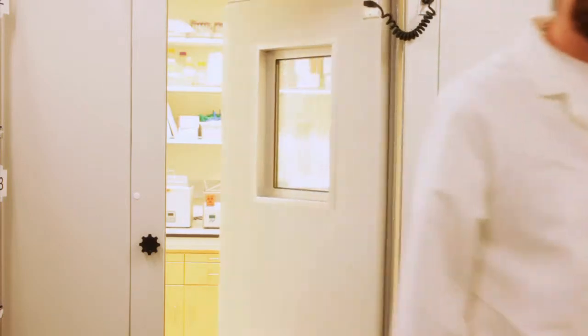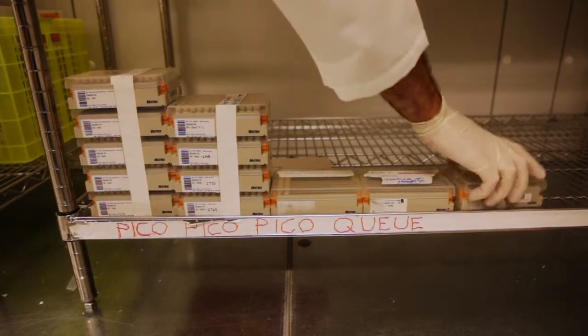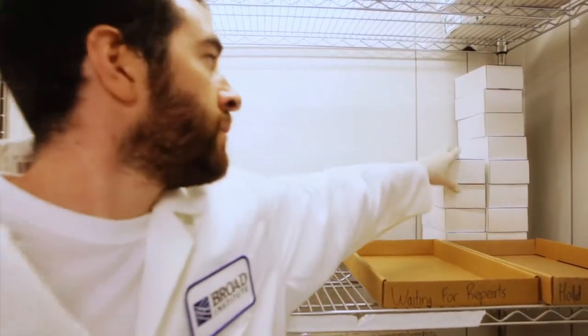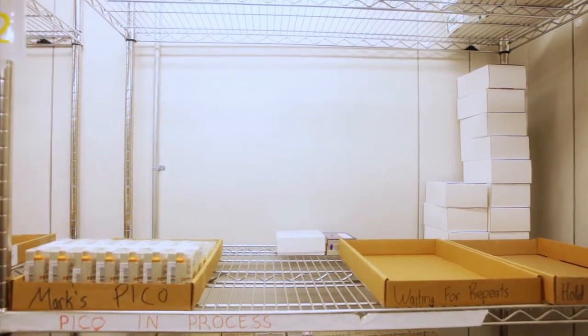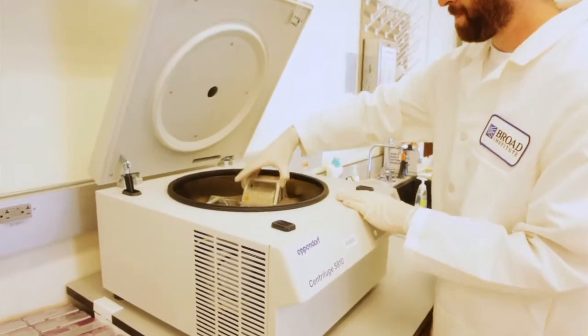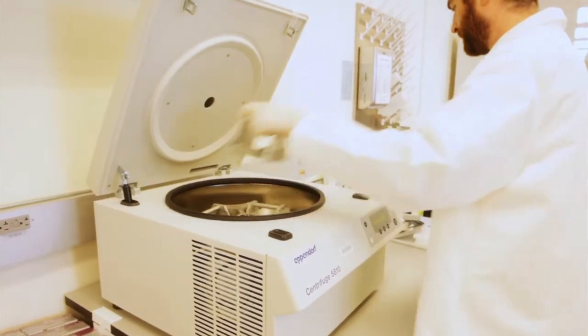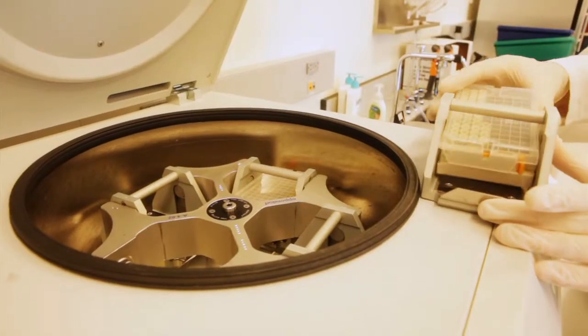He begins by removing the samples from a 4 degrees Celsius storage room. My name is Mark Poppo. I'm the research coordinator for the Biological Samples Platform. I handle all of the DNA quantification and normalizations that go on at the Biological Samples Platform.